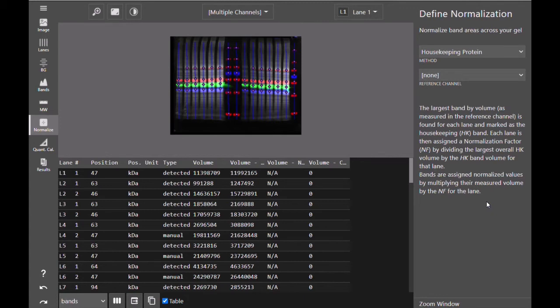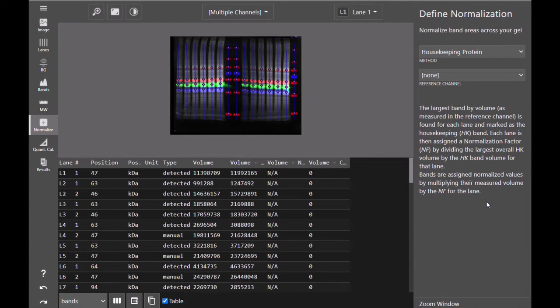The largest volume housekeeping band in the entire reference channel is then set as the reference band. The volumes of the housekeeping bands in all other lanes are compared to the volume of the reference band and this determines the normalization factor for each lane.